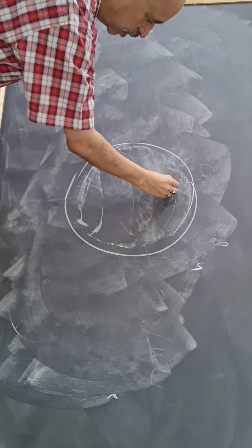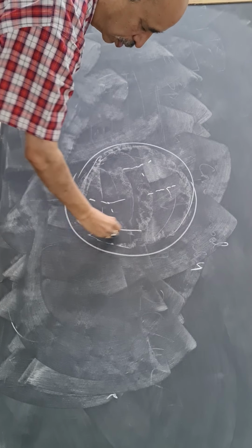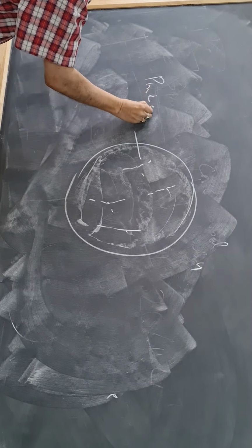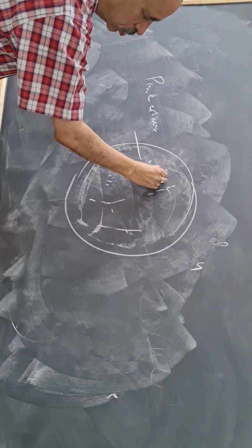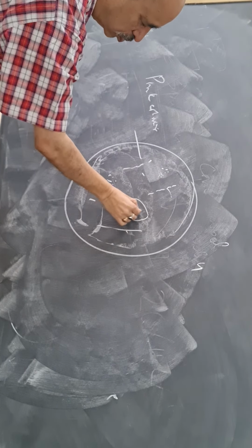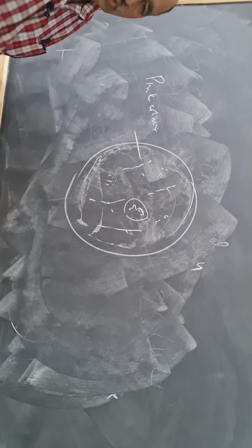These bacilli are long, slender, slightly curved. They look pink in color, pink colored bacilli, and other things all look blue. For example, Staphylococci and pus cells all look blue.